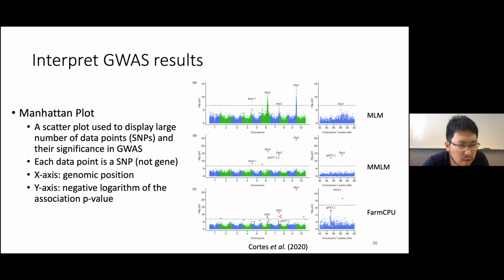Let's take a look at the question now. Which is the better platform to use, command line or graphic interface, if you're using millions of SNPs? The command line. It will offer you more freedom in operating on those high dimensional data, and it's much faster than the graphic interface. Often the larger the data set, the more likely it is to use the command line. Yeah, that's true.